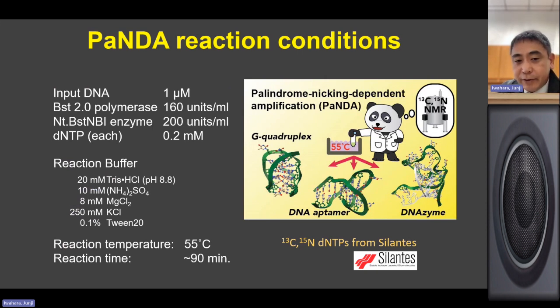If you use too much, somehow it didn't work very well, if I remember correctly. Anyway, 1 micromolar is close to the optimal, probably for almost any case. But I don't know, we checked only several different DNAs for that. As far as we know, 1 micromolar is probably around the optimal range.